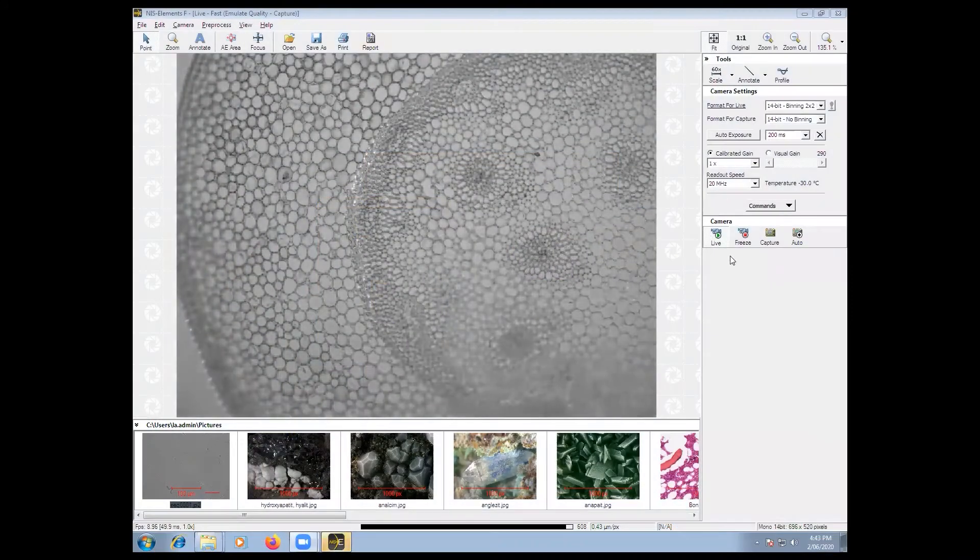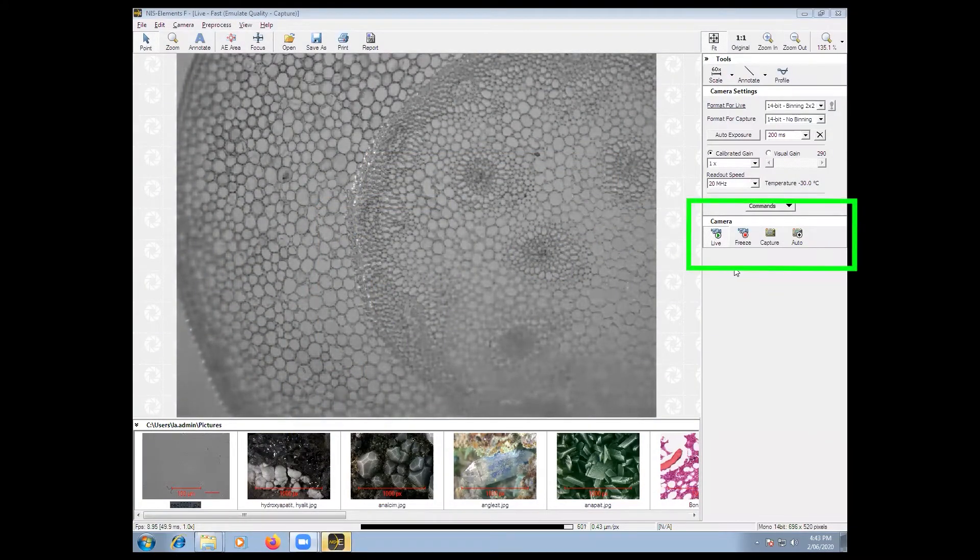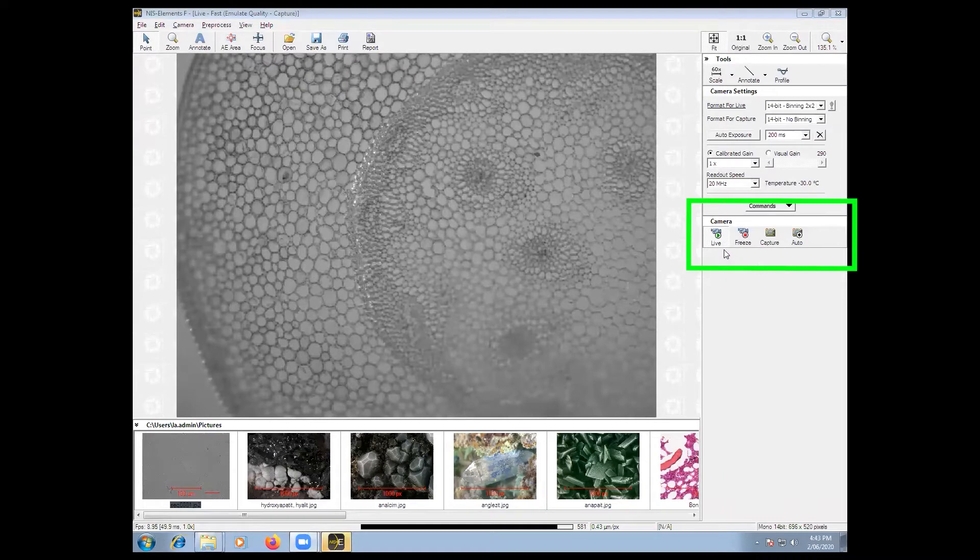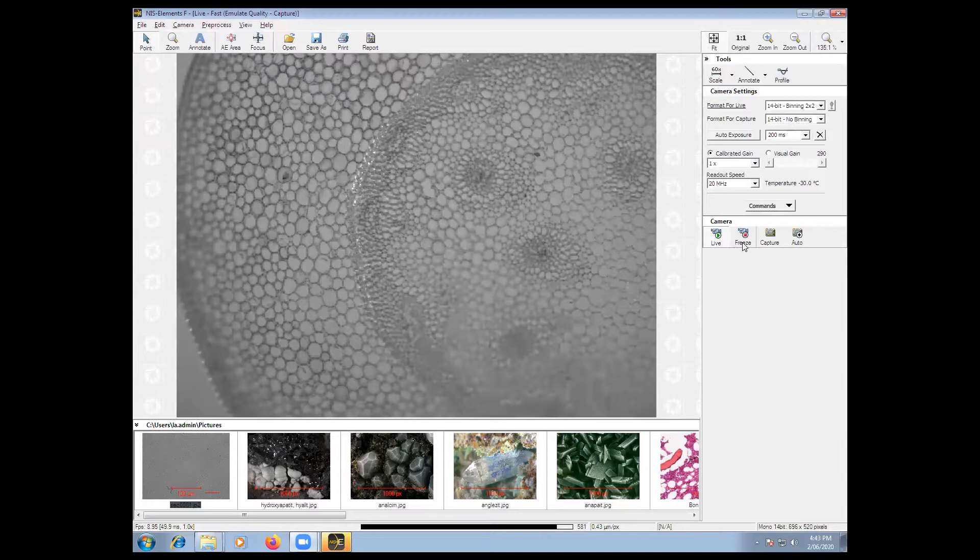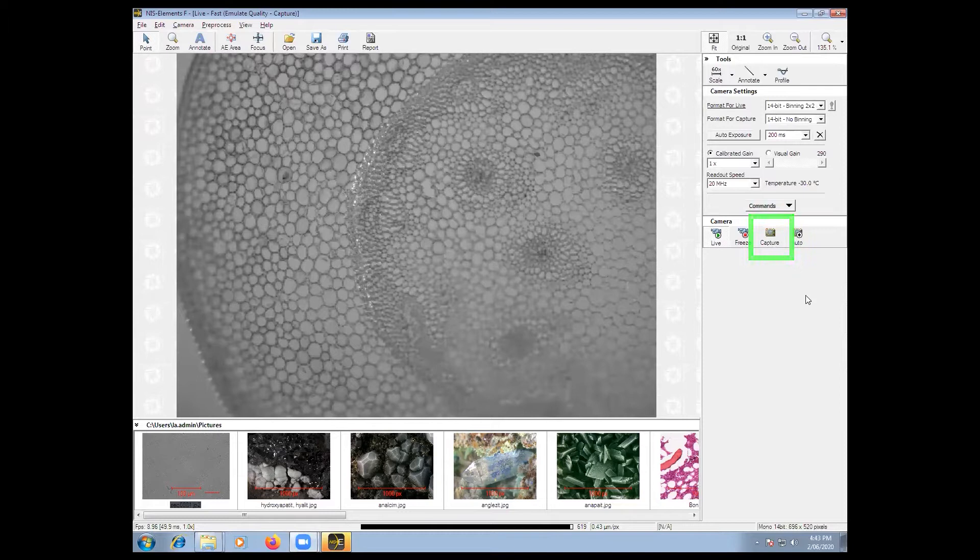Once the program launches, go to the camera menu bar. The live feed allows you to look at your image in real time. Pause stops the camera but doesn't save the image. Capture takes a snapshot of the image but it does not save it.